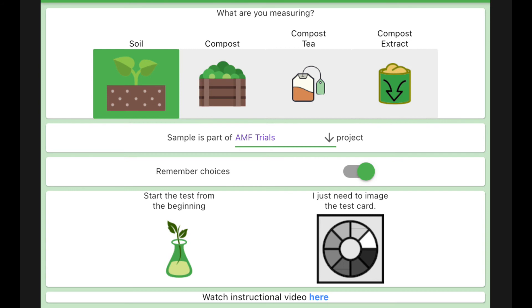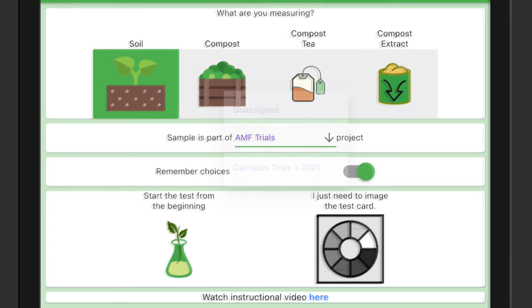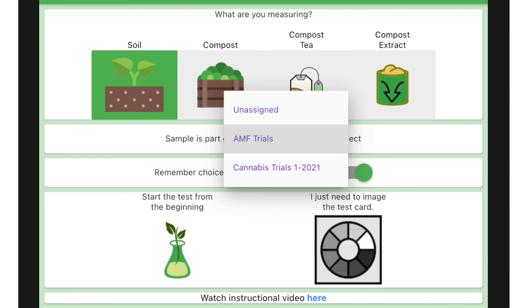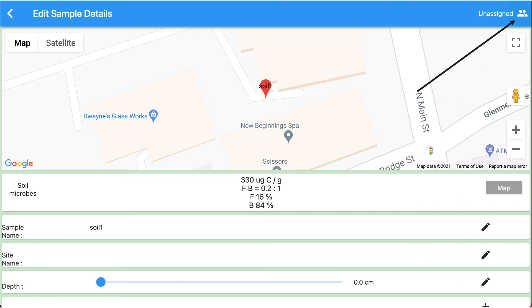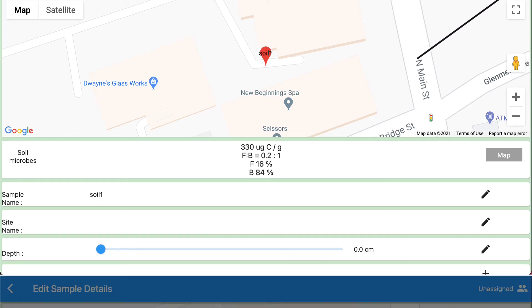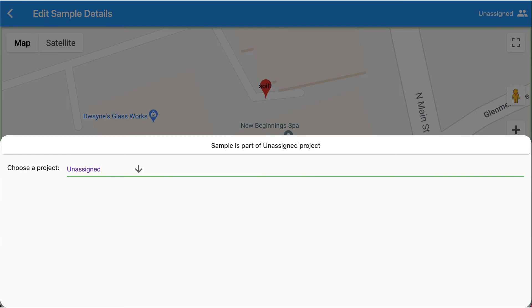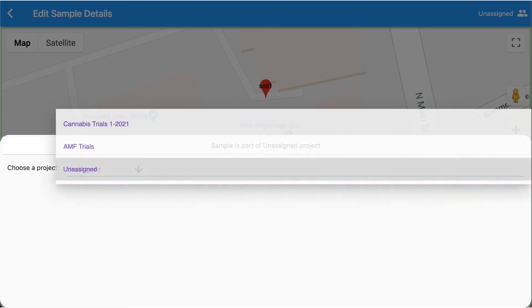After you have set up your project or projects, when you go to read a sample you can assign that sample to a project before you read the test card. Here we have two new projects to choose from, as well as one called unassigned. Unassigned means that this sample won't belong to any project of which you are a member. If you are already a user of Microbiometer, all the samples you have taken are unassigned to any project. If you would like to change the project to which a sample belongs, click the group icon in the sample edit screen. A screen pops up that allows you to choose the project — here are three choices including cannabis trials and AMF trials — and this sample will now become part of that project.